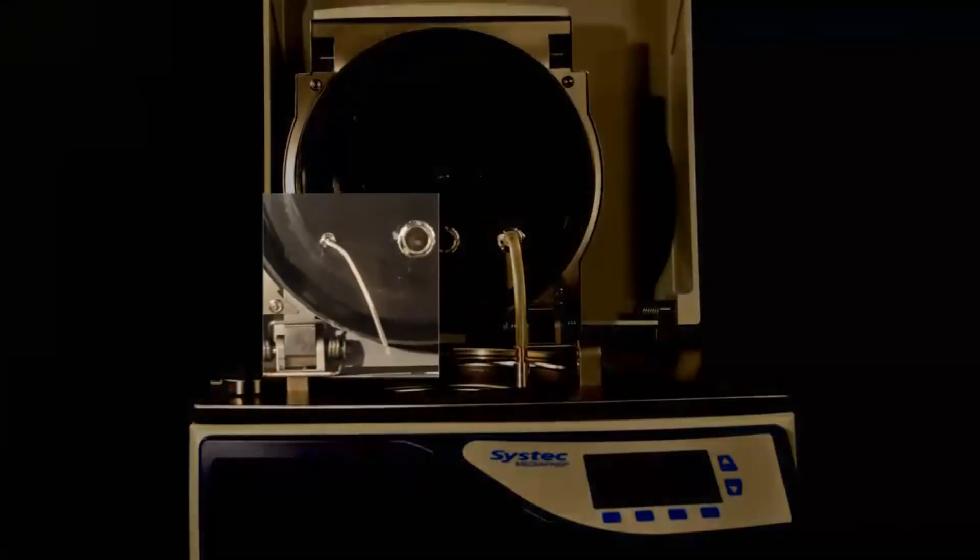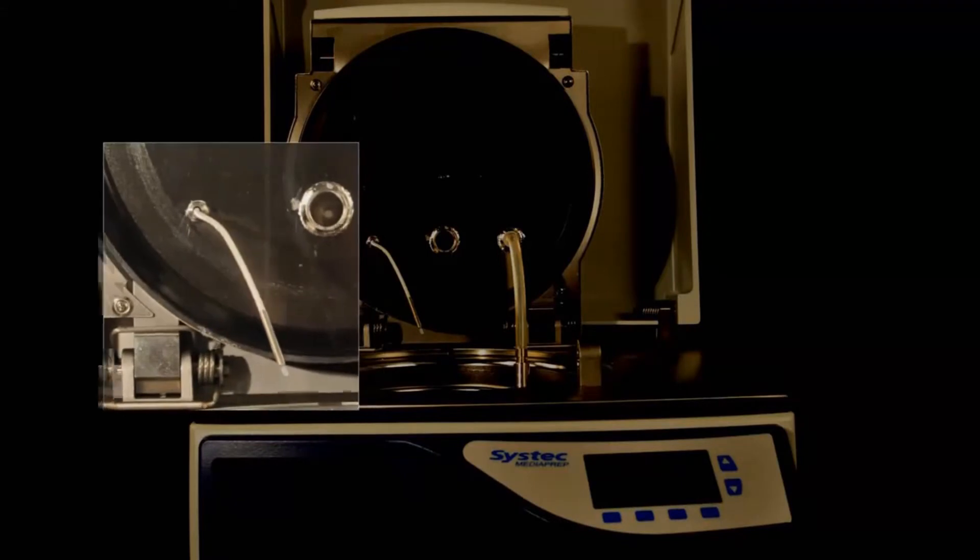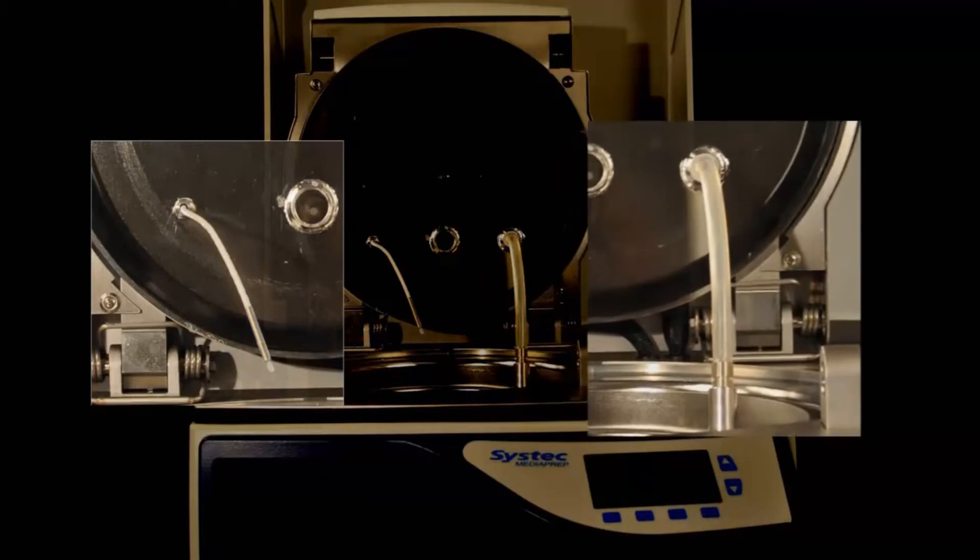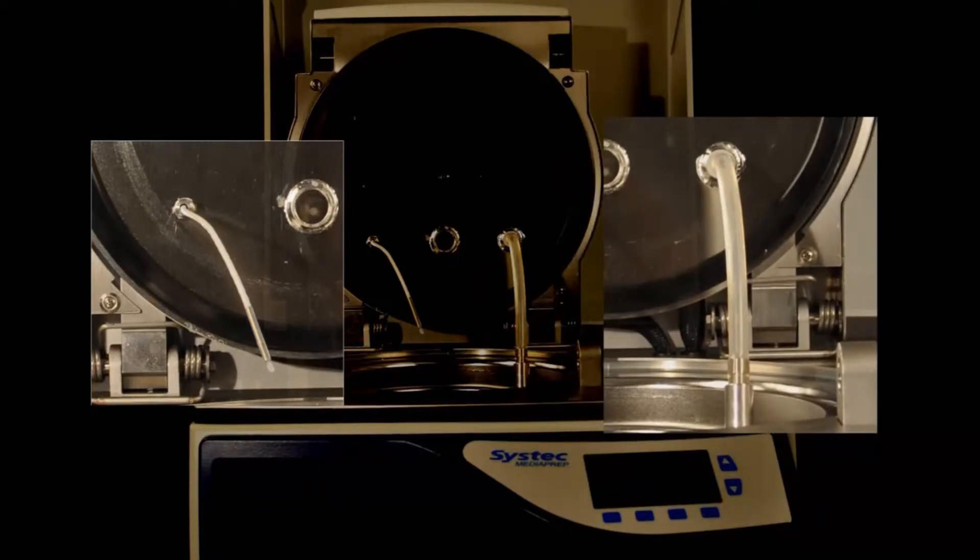A flexible temperature probe directly measures the temperature of the liquid throughout the entire cycle. The dispensing tube allows the media to be dispensed either using a peristaltic pump or by pressurizing the sterilization vessel.